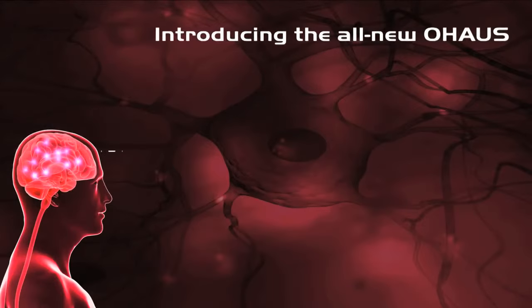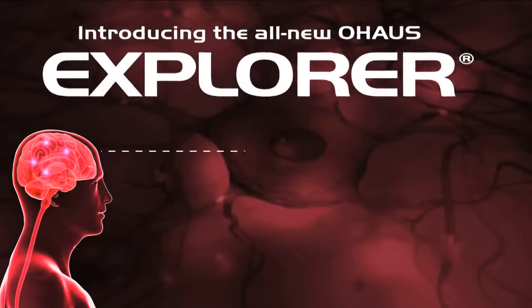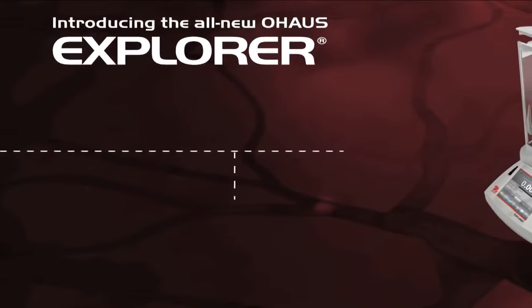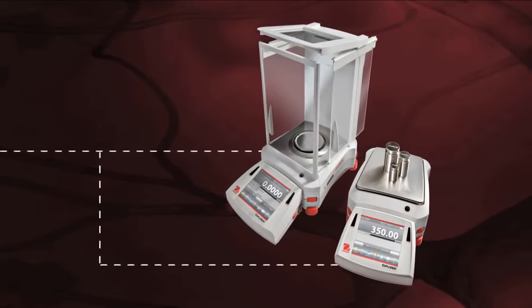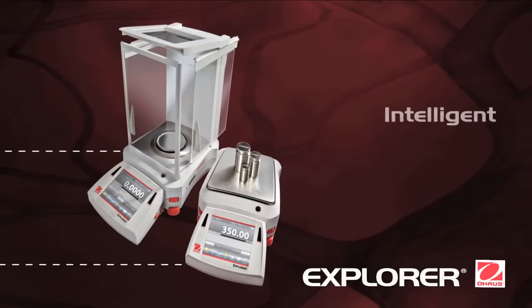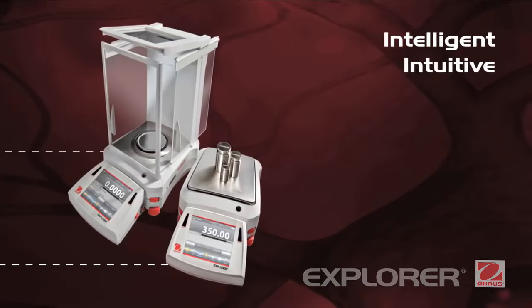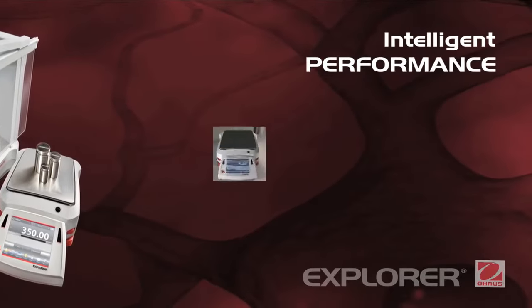Introducing the most intelligent and intuitive balance ever to come from the mind of Ohaus. The all-new Explorer represents a revolutionary shift in the way you interact and operate a weighing instrument — completely reimagined from the ground up. Intelligent. Intuitive. Ingeniously practical.